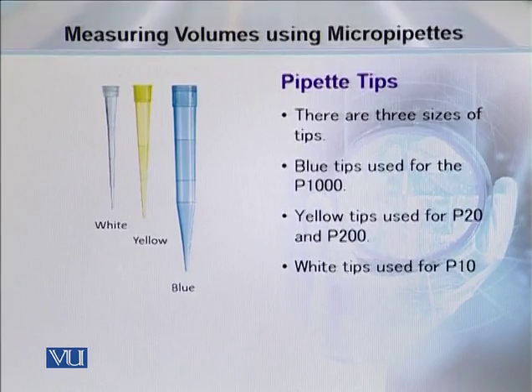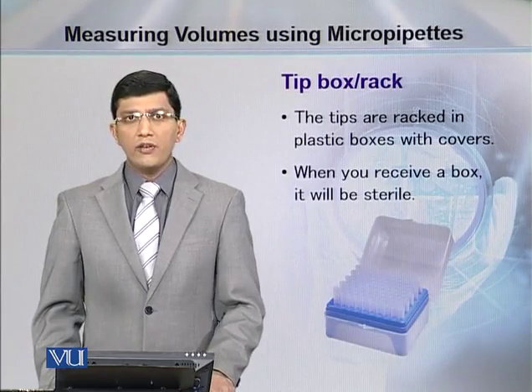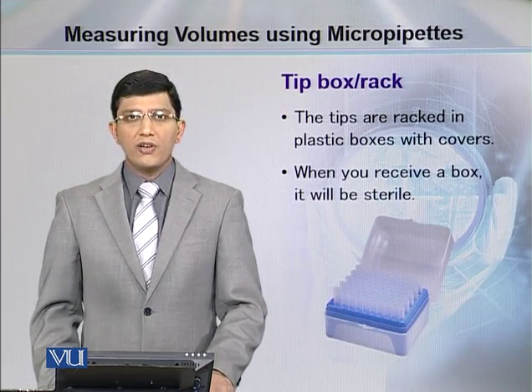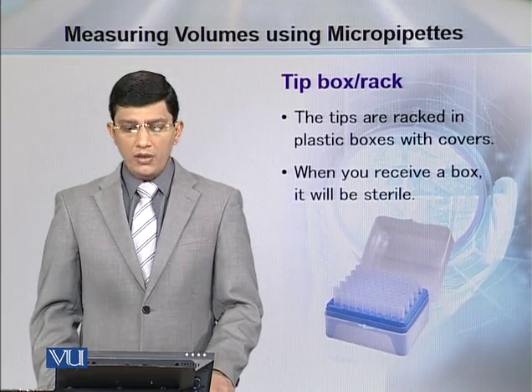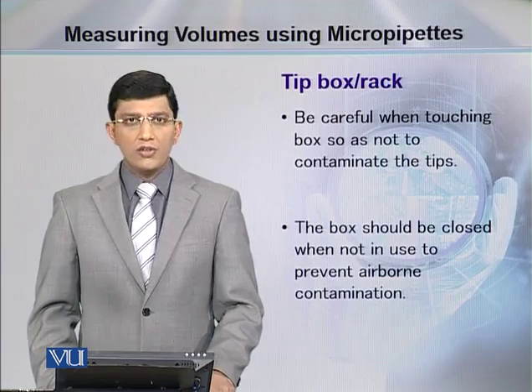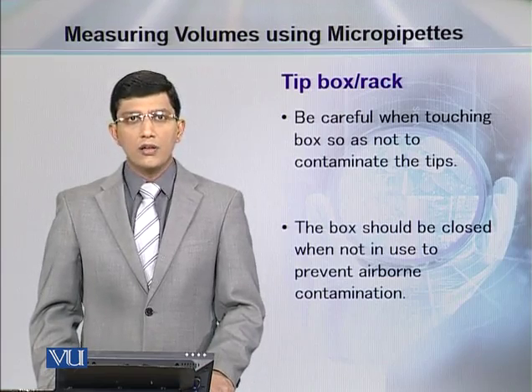for P10 micropipette. These tips are supplied in the racks or the boxes which are normally sterile. So when these boxes are not in use, do cover them, otherwise there will be some airborne contaminations and it is going to ruin your experiments.